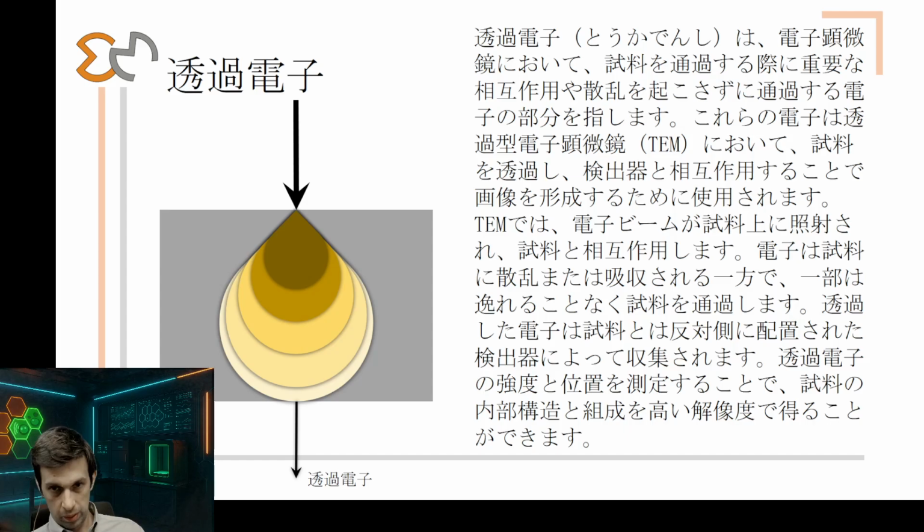This is because, if you think about it, the nucleus of the atom is just very small, and there is a lot of empty space, so there is a relatively high chance that an electron can go through one atom without hitting the nucleus. Of course, then we have layers and layers of material, so we have many atoms, so the chances of going through without hitting anything, and without getting deflected or absorbed, etc., decrease with the thickness of the sample. But in transmission electron microscope, we focus on the electrons that can make it to the opposite side.